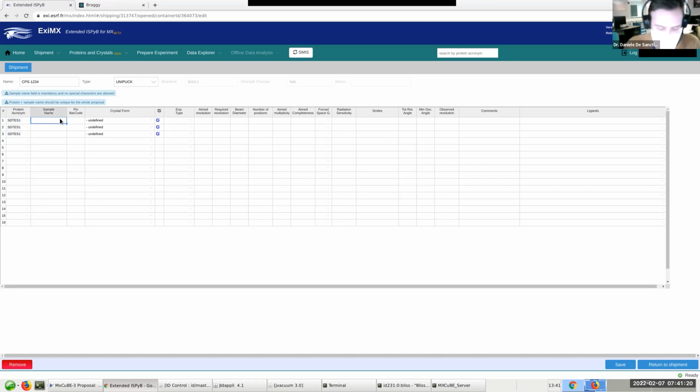Then I need a sample name, and it's very important, but you will be reminded when you prepare your experiment, that the combination of sample name and protein acronym must be unique over your proposal. So let's just call the sample for today user meeting tutorial_1. And now if I scroll down, this will be named 1, 2, 3. Actually, now I double clicked on the square and it filled the empty spaces.